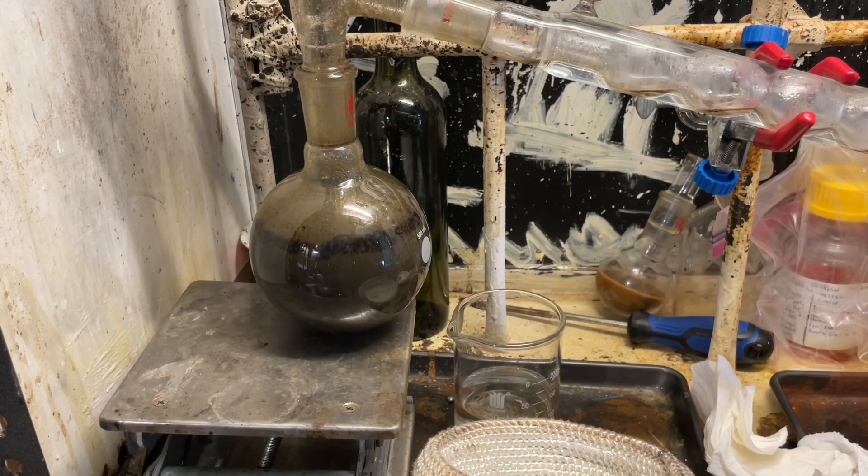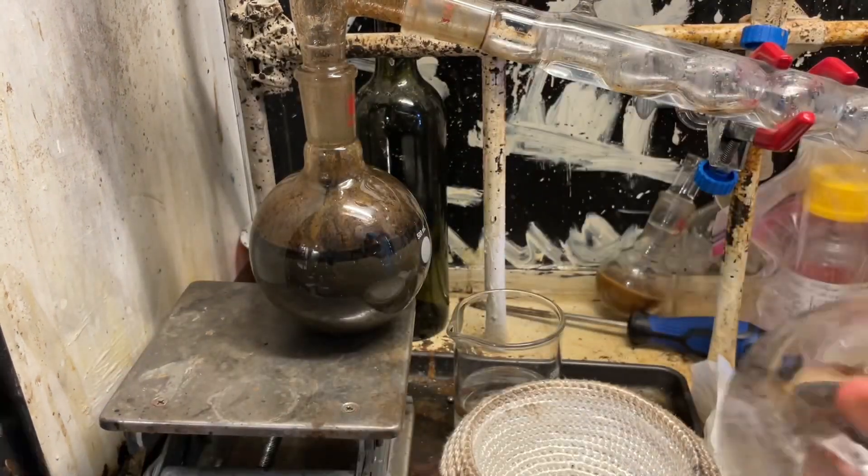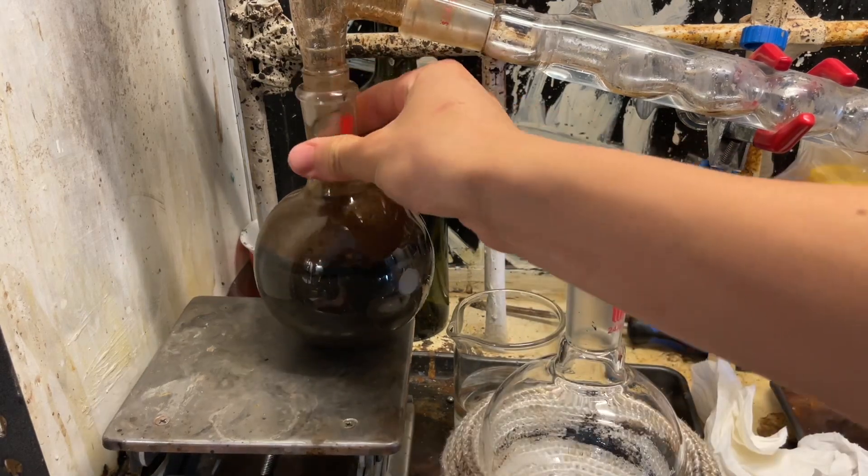Put on a new flask. Let's see if we can see why it bumps. We're getting tar in our product now. Let's try transferring it into a new flask — maybe that'll solve it.